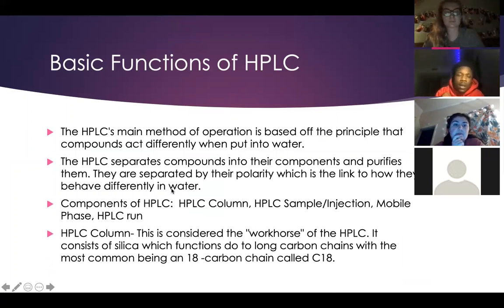So next, I'll talk about the basic functions of the HPLC. The HPLC's main method of operation is based off the principle that compounds act differently when put into water. The HPLC separates compounds into their components and purifies them. They are separated by their polarity, which is the link to how they behave differently in water.